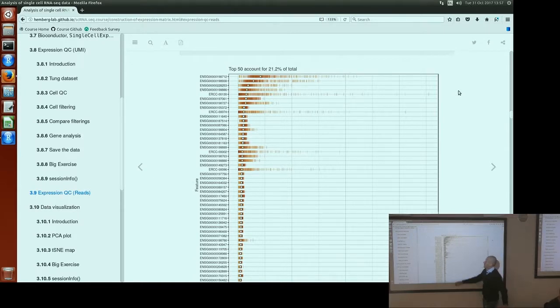So the question is, we have a spike-in which has a very variable expression across cells. So do we ignore it when we normalize by spike-ins? I think when you normalize by spike-ins, you don't ignore any of the spike-ins. So you need to make sure that you have good spike-ins in the first place. Ideally, it depends on your experimental condition, it should be the same in every cell. The whole point is the assumption that the concentration should be the same. That's why you normalize. But if it varies so much, maybe it's not a good spike-in yet.